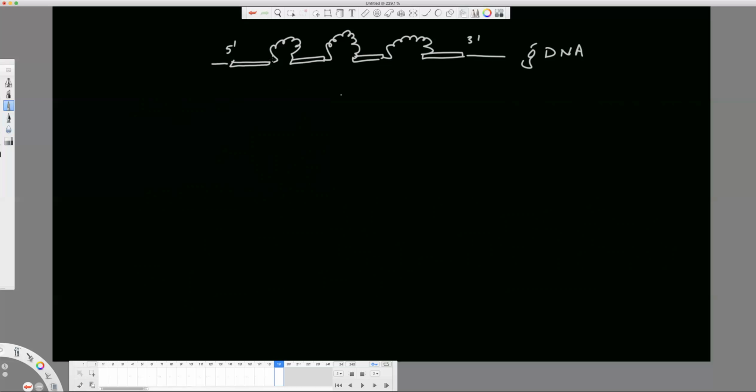Now, when you do expression profiling, you're not interested in genomic DNA. What you do is the following. You isolate from yourself the RNA, mature RNA, right? So that would look like the following. It will not have introns because splicing has been done by the cells. First exon concatenated to the second one, to the third one, and to the fourth one.